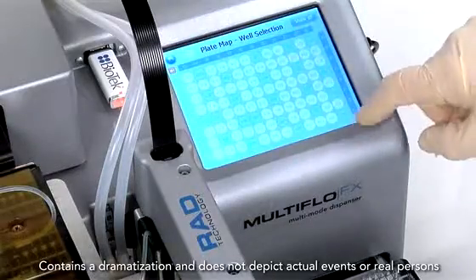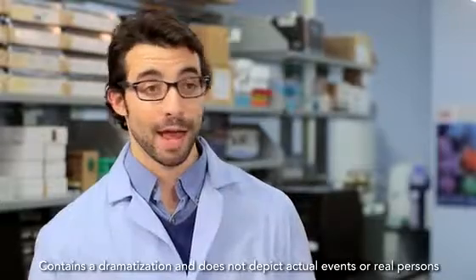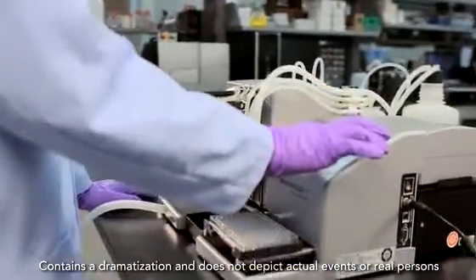The touchscreen is great. It's intuitive, easy to program and use. It's pretty powerful when you see what you can do with the interface.